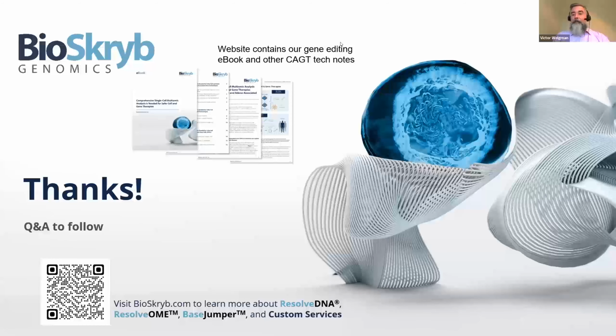That's a great question. The BioSkryb kit solutions are RUO, right? While we do process those kits in a controlled facility, it's up to an individual lab or a CRO to help build an LDT-based process that suits your needs. Same thing for BaseJumper. BaseJumper is an RUO-based analysis platform. We'd love to help and be involved in that process. Finding the right lab, we can help provide the materials and ingredients to do that. But yes, not this time. This is a research area. It's meant for exploratory studies at the current moment.